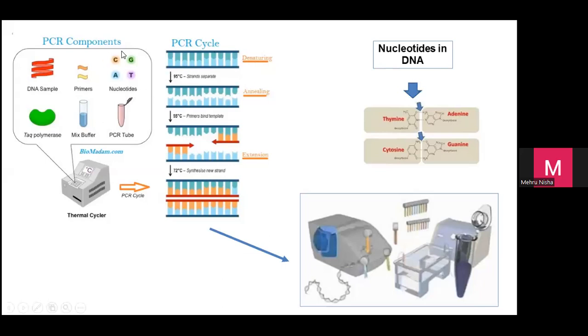Okay. Then what we will do, all this. What is the function of DNA polymerase? This is the enzyme nak bagi mereka semua lekat, macam gum, dia initiate the polymerization technique. Okay, kita mix, we put in a tube, then put dalam machine. PCR machine ni, the correct name is thermocycler.